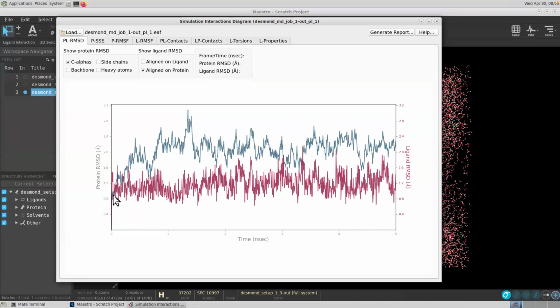Okay. So in this plot, what we are seeing is that initially it is gradually increasing. It is starting from 0, and after some point of time, it is fluctuating around an average value of 2, maybe 2 angstrom something, right? It is fluctuating here, which means that after 1 nanosecond or 1.5 nanosecond, we reach this stable structure. We have the equilibrium structure now, and whatever properties we calculate will have some meaningful result, right?